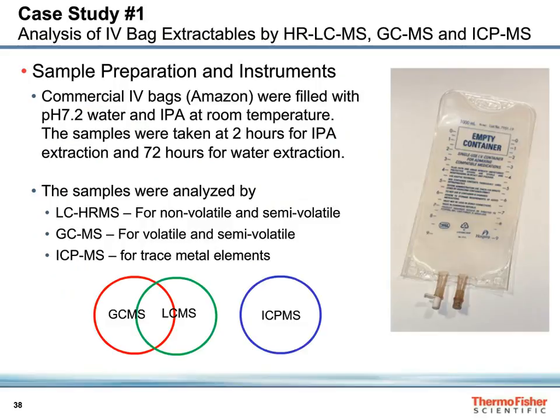Now here I just use one experiment to quickly demonstrate this workflow. This is the IV bag, which everybody knows. Because of the compounds we deal with, we use the GCMS, LCMS, and ICP-MS to capture the whole range of the compounds. And then the workflow actually is very easy.